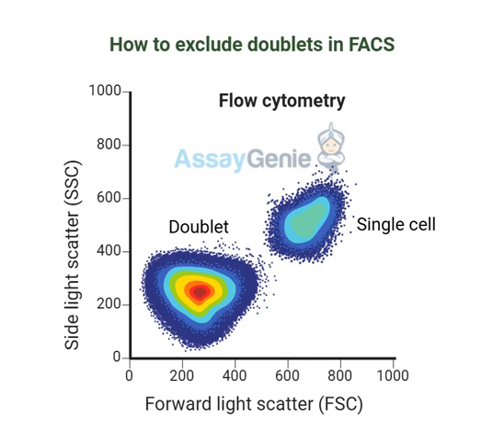It's a great question. You see, it's not just about being super precise in the lab. It's about making sure we're getting the whole picture and can make good decisions, especially when we're talking about things like health and medicine. Okay, so can you give me an example? How could something like doublets actually affect people's lives? Okay, well, imagine researchers are testing a new cancer drug. They're using FACS analysis to see how the drug affects different cells in a tumor. Makes sense. But what if those doublets aren't properly filtered out? The data could end up being totally misleading. Oh, wow. How so?